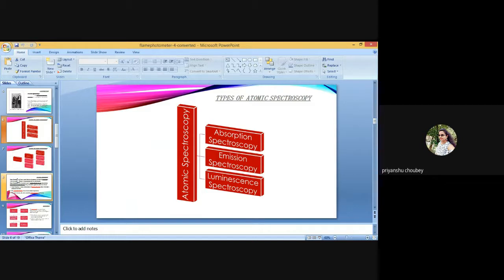If nitrous oxide acetylene flame is used, turn on the nitrous oxide acetylene supply cylinder. Select air with the support selector knob. Adjust the support for an air reading between 6 and 10 flow units.